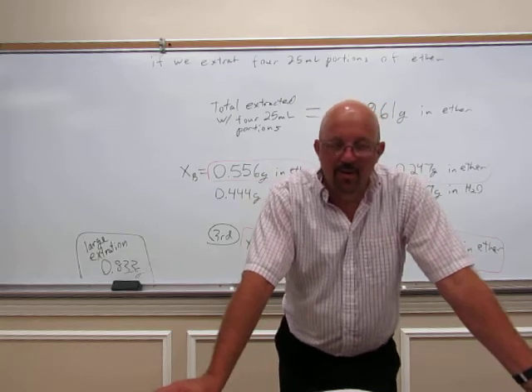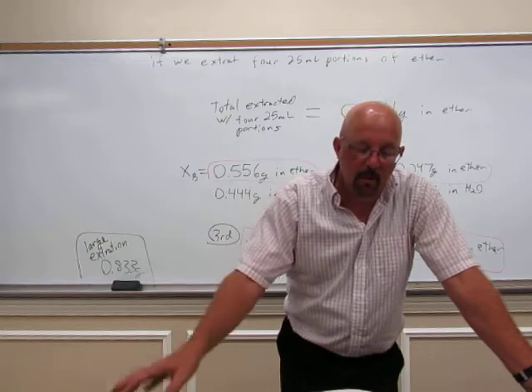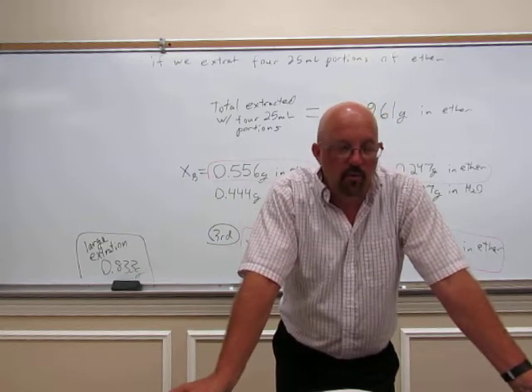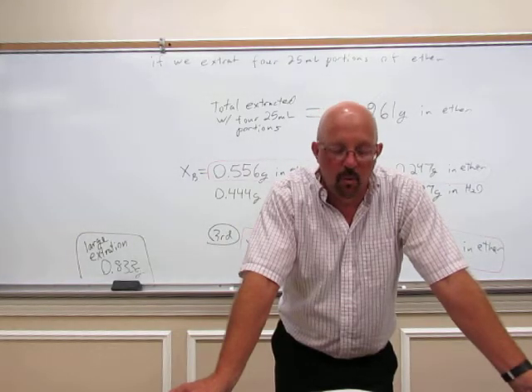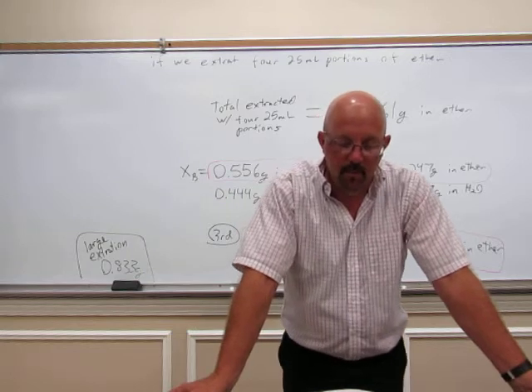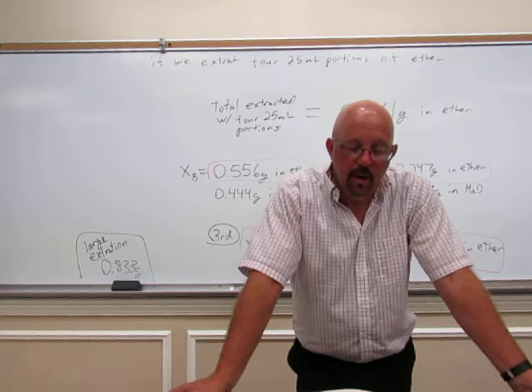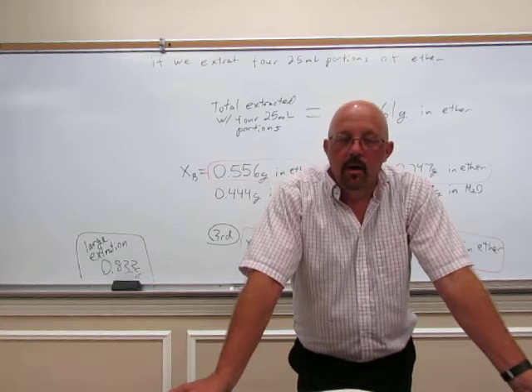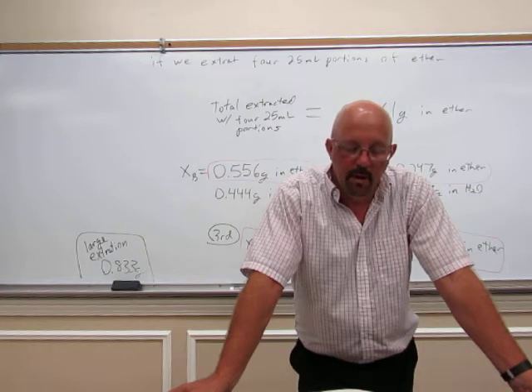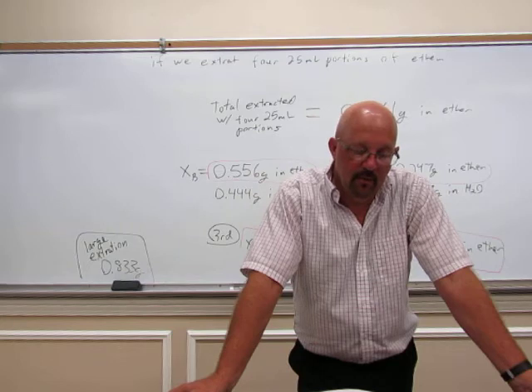And you should use the deionized water. There's deionized water by the sinks. They're in some squirt bottles. It says deionized on there. Anytime we're going to use water in one of our reactions or experiments, always use deionized water or purified water. Now, make certain you know which layer is which. The dichloromethane layer should be on the bottom and the water layer should be on top. So just make certain you can see that as you mix those together.